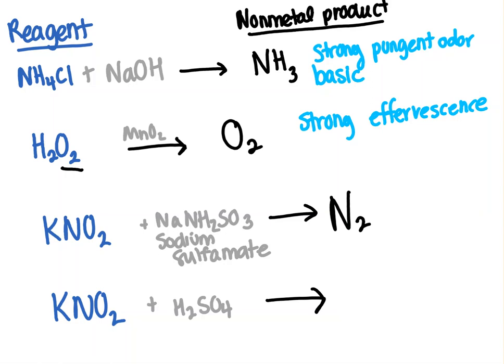And so it doesn't have a color. None of these have a color so far. It doesn't have a smell. It's neutral. It has a mild effervescence. So this is the one that you may have seen a bubble or two. So not a whole lot to go on with that one. Luckily, we did another reaction with the potassium nitrite, and it's a little bit more interesting.